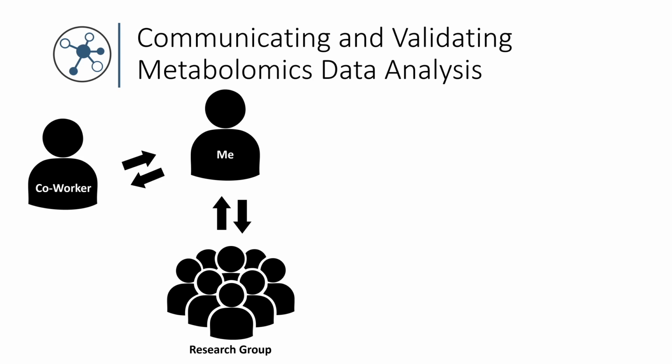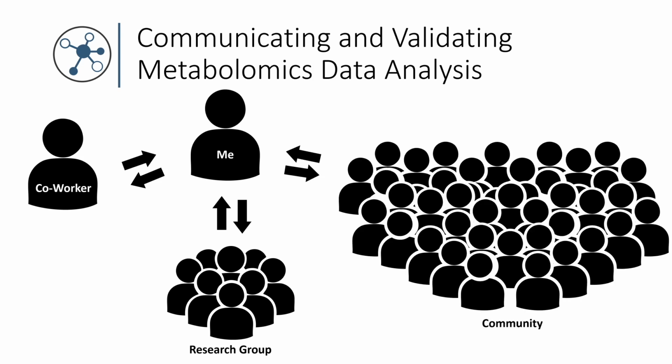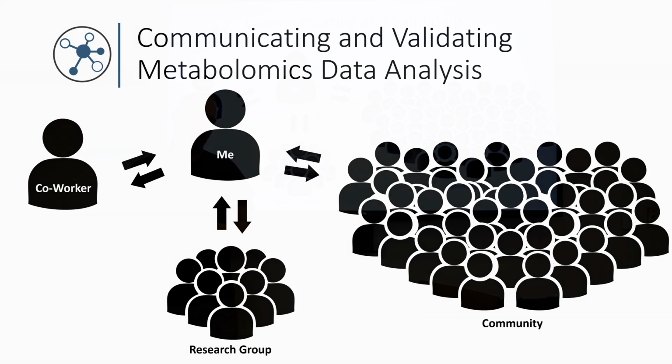I think it becomes especially challenging when we think about our interaction with the community. Having everybody being able to reproduce our data analysis and inspect our raw data is quite a challenging task, which, for example, in peer review, often prevents transparency and reproducibility by others.